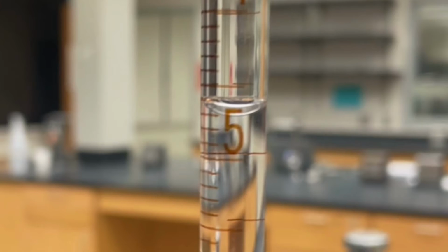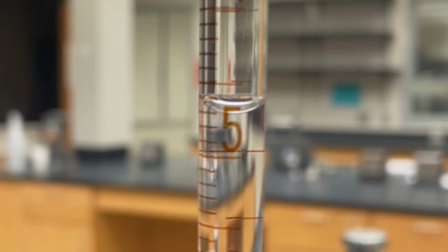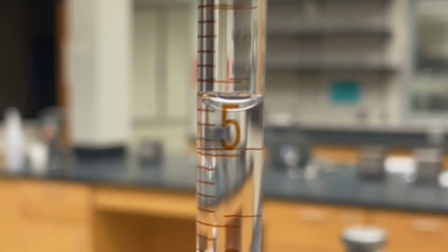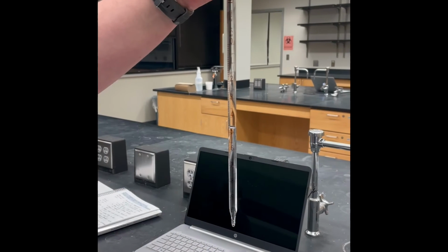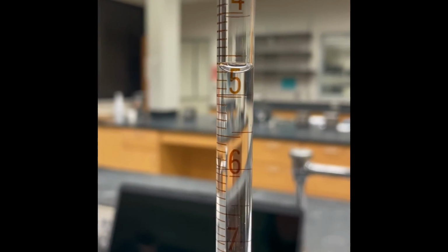Because of the meniscus's concave shape, the liquid you are measuring may seem to be at different volumetric values depending on where in the curve you look. To solve this issue and get an accurate measurement, always make sure to measure a volume sample at eye level and to take the actual reading from the bottom of the meniscus. In this example, you can see that the bottom of the meniscus sits at 4.70 milliliters.